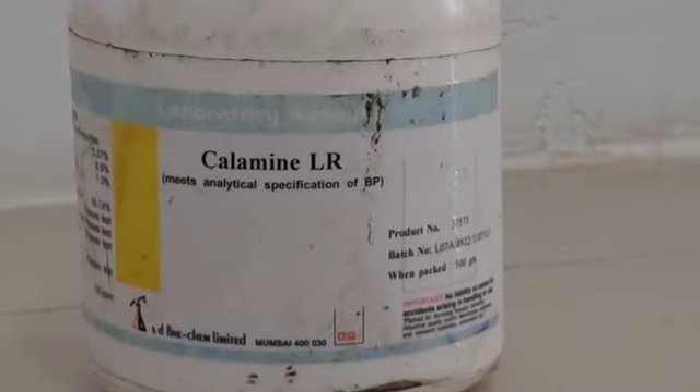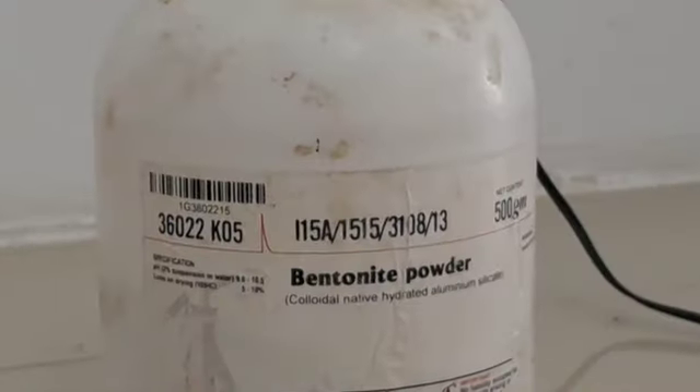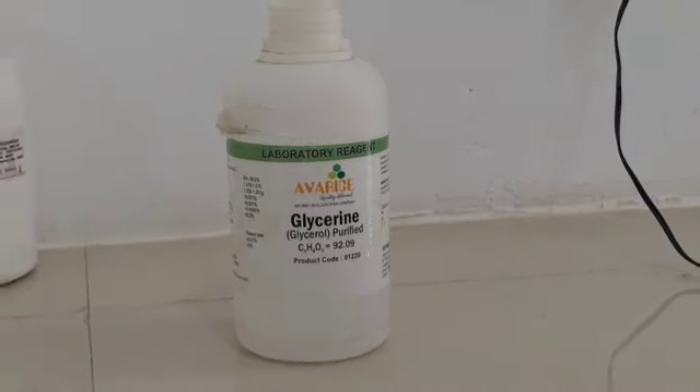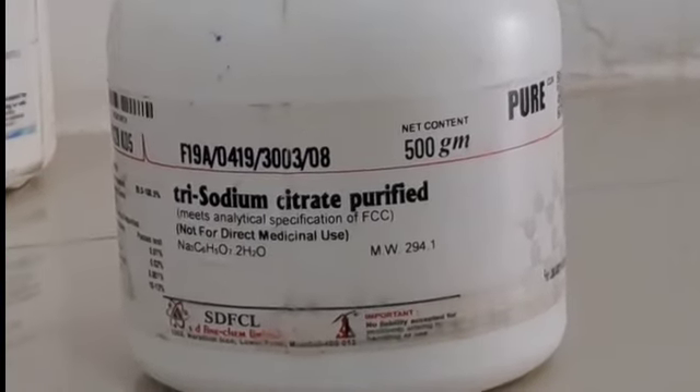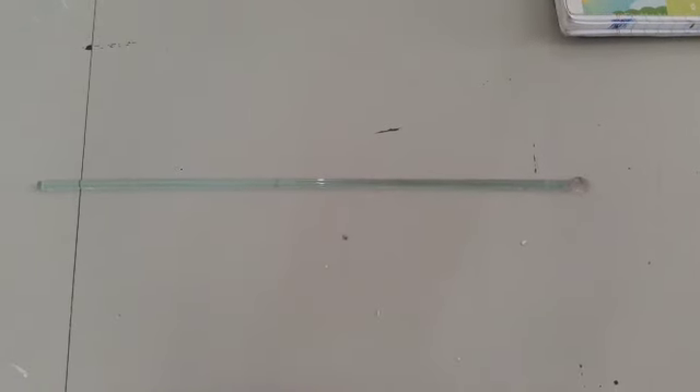The chemicals required are calamine, zinc oxide, bentonite, glycerine, sodium citrate, liquid phenol and rose water.